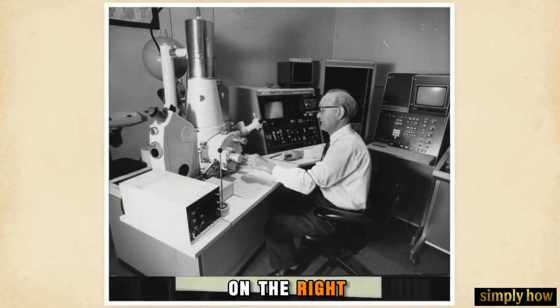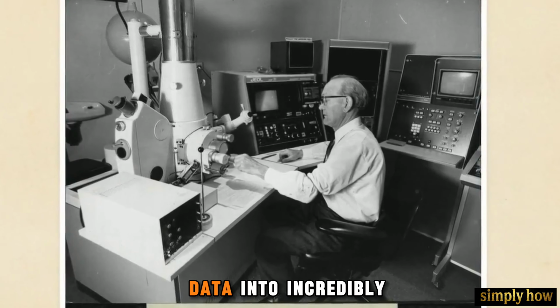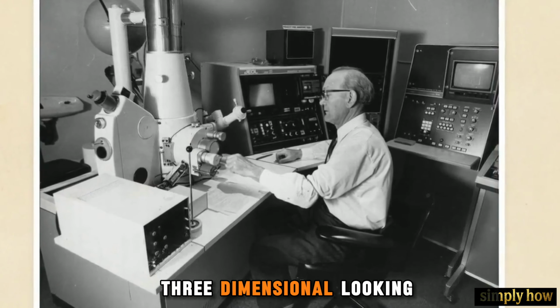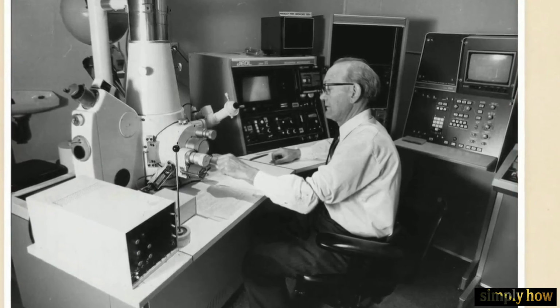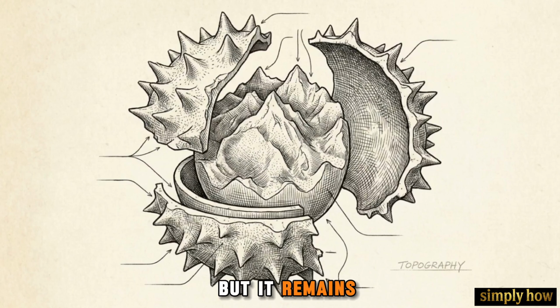Check the monitors on the right side of this desk. These digital workstations render the detector data into incredibly deep, three-dimensional-looking grayscale topographies. The SEM sacrifices the sub-nanometer internal resolution of the TEM and requires a metal coating, but it remains the primary tool for mapping the complex 3D reality of a surface.